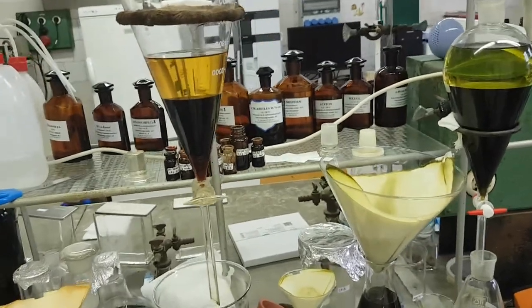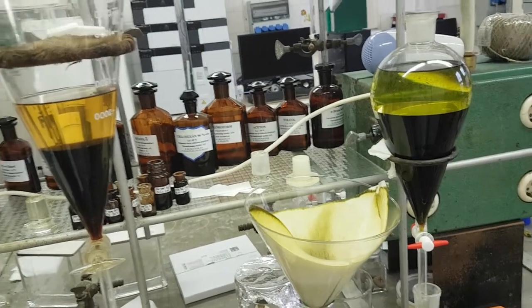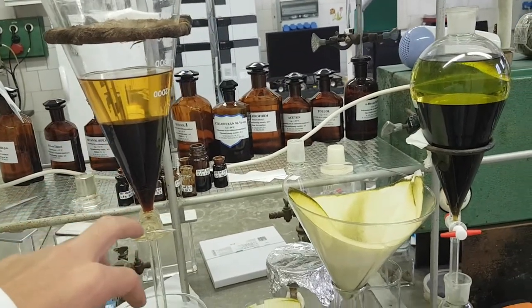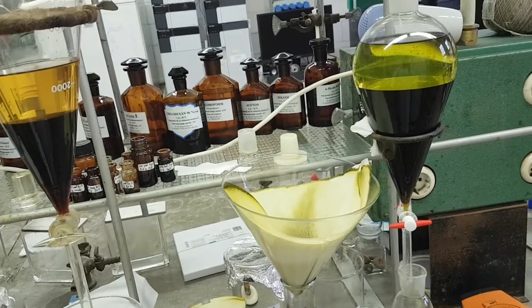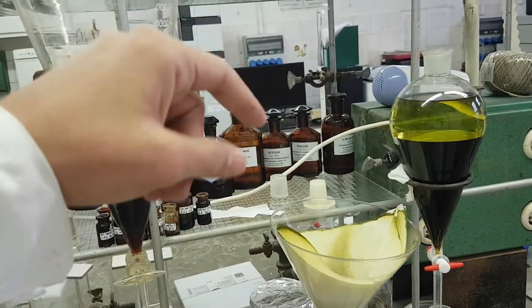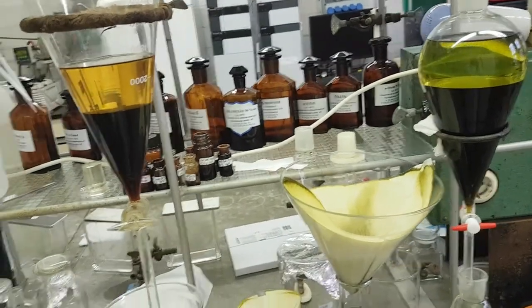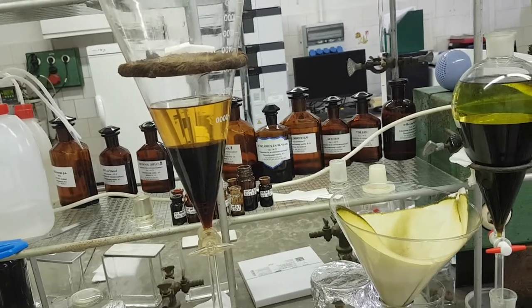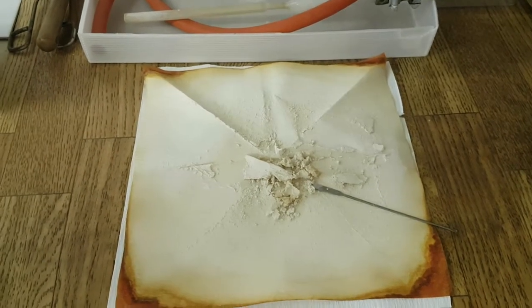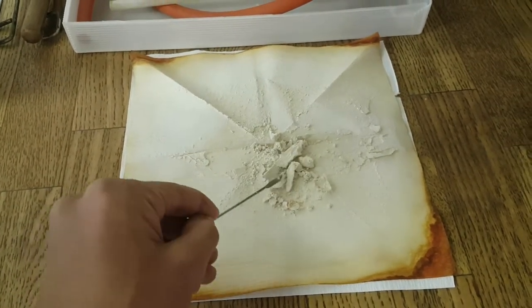Liquid-liquid extraction is considered an effective method for fractionation. It is recommended to fractionate your sample before subjecting it to column chromatography or HPLC if you would like to isolate some compounds. After this, you can isolate a crude extract, as you can see here.